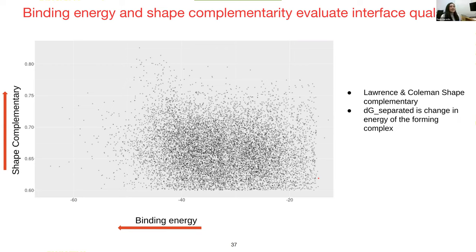Yeah, I'm not sure yet. The idea was, if I can get the BLI data and evaluate it, maybe then I could go on and do affinity maturation at that point. But I guess I still just want to know the affinity first, maybe the competition, and then that was my initial goal, to maybe go into affinity maturation. I'm still in the learning process of that as well. Yeah, that makes sense. I was just curious if you had started thinking about it already.